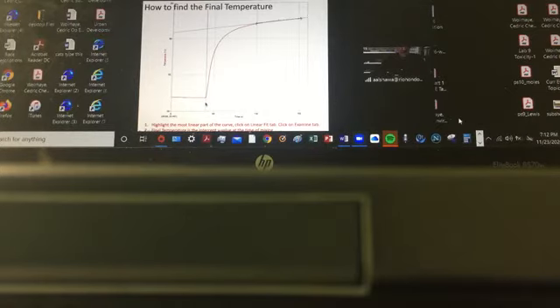Once you add a metal, the water inside the calorimeter is going to heat up a little bit, so the temperature will rise. It continues rising until some point, then it's going to slow down and plateau a little bit, then slow down back to the room temperature. So we're going to see the following plot that has three portions.